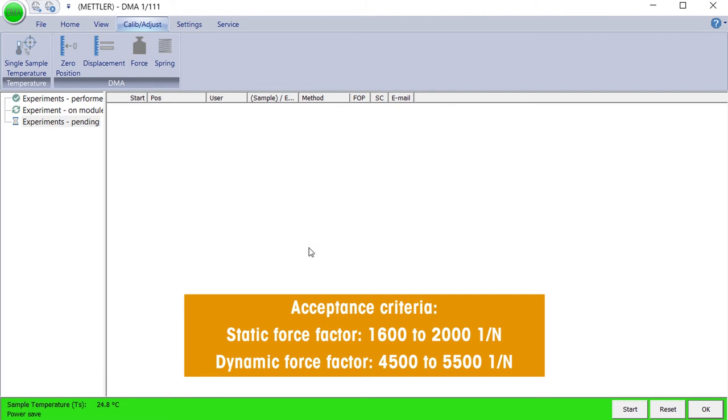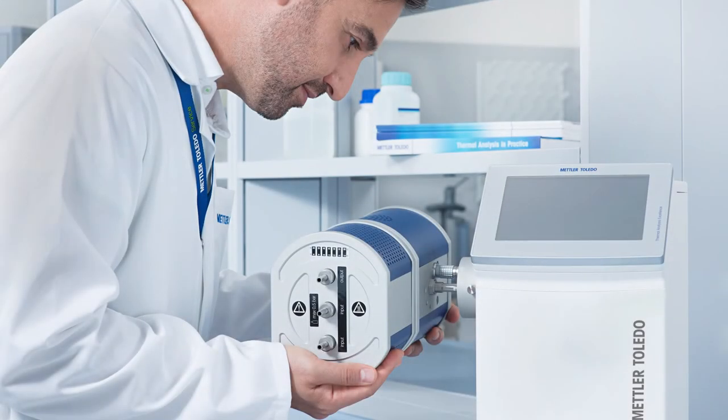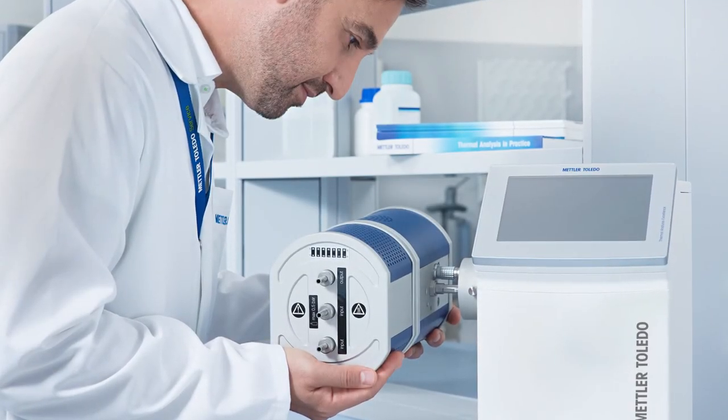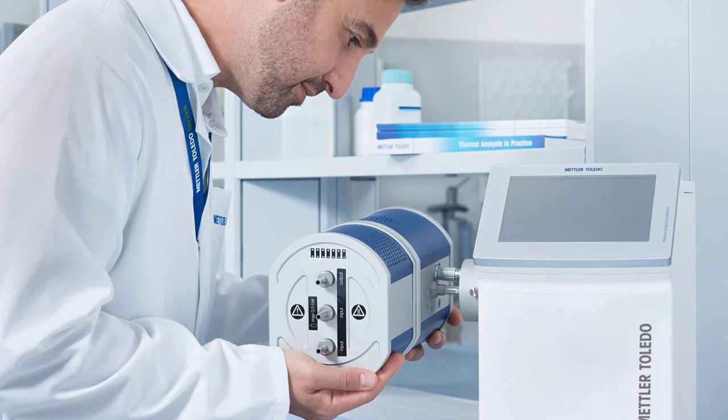Otherwise, discard the calculated parameter value by clicking Cancel. Mettler Toledo recommends preventive maintenance combined with calibration for your TA module. This instrument-specific service is typically performed in predefined intervals to ensure long-term and failure-free operation.